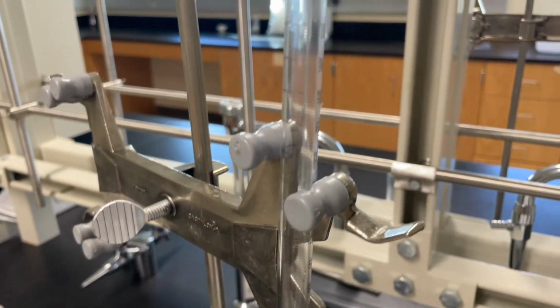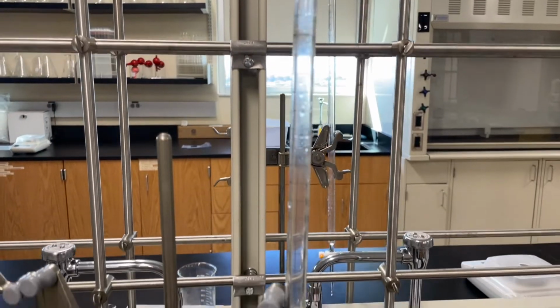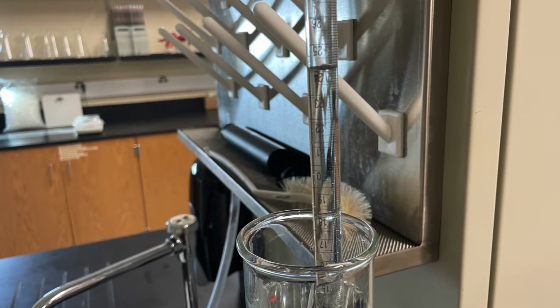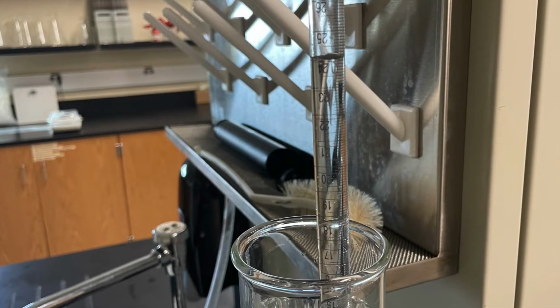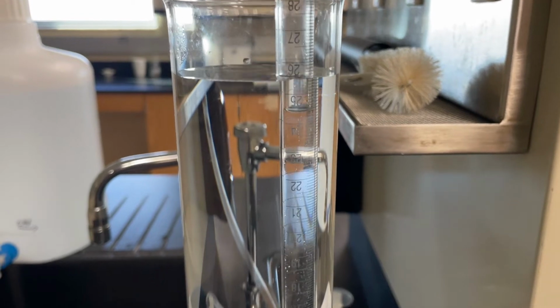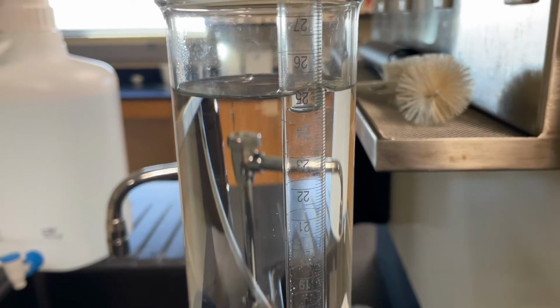So at this point, we need to record the volume of gas. But first, we need to make sure that the pressure on the inside and the outside is equal. So we take it over to a large cylinder. We'll line up the meniscus of the cylinder and our burette, and we will measure for the volume of gas with equal pressure to the outside and inside.